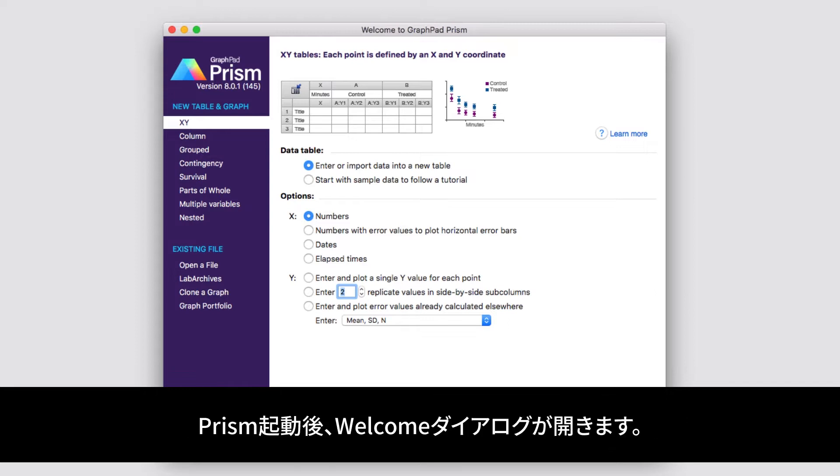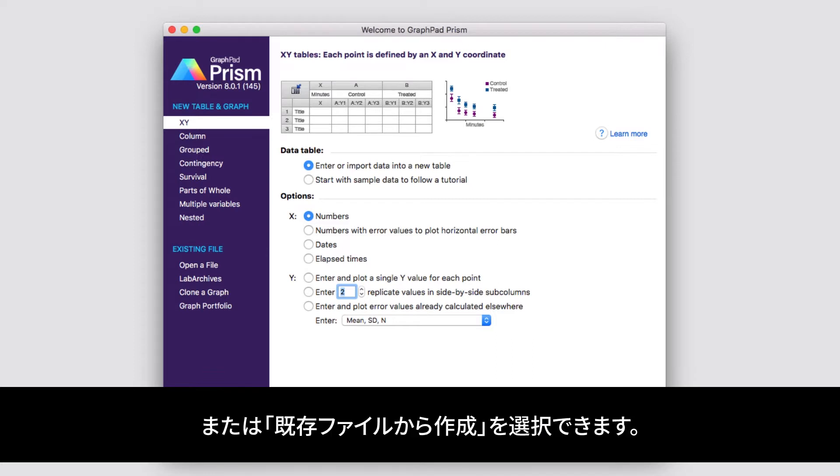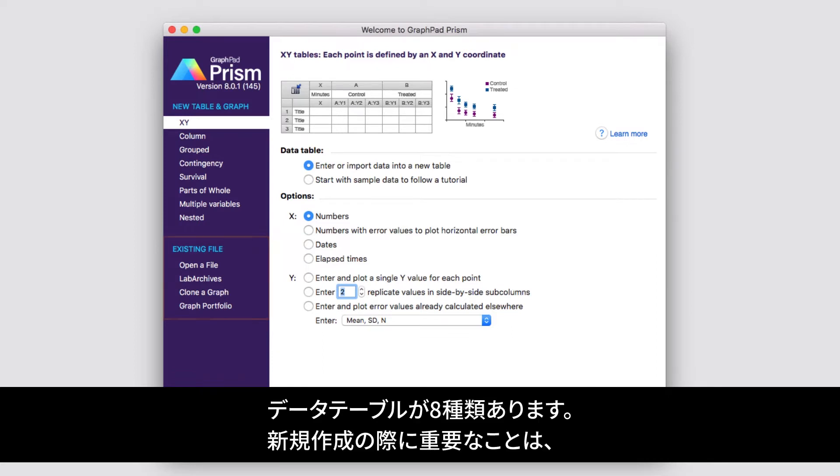When you first start Prism, the first thing you're going to see is the welcome dialog. From the welcome dialog, you can choose to create either a new data table and graph, or to open an existing file and work with that. If you're going to create a new data table and graph, it's important to understand the eight different types of data tables that Prism uses.